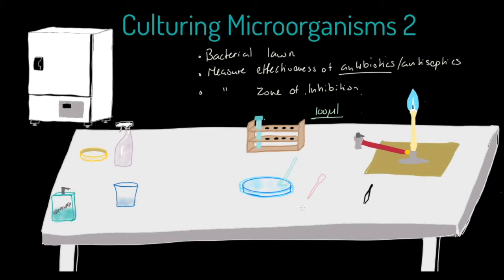Okay, so there's a couple of things there that I would encourage you to think about. I'm not going to go through this whole process. You can do that within your own practicals and your own studies. But that spreading technique prepares for us our bacterial lawn.